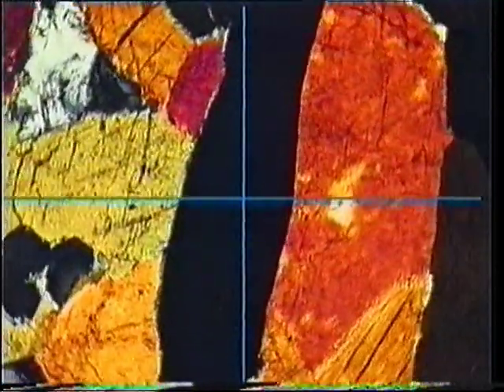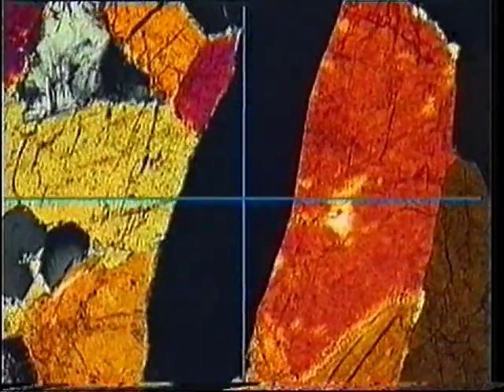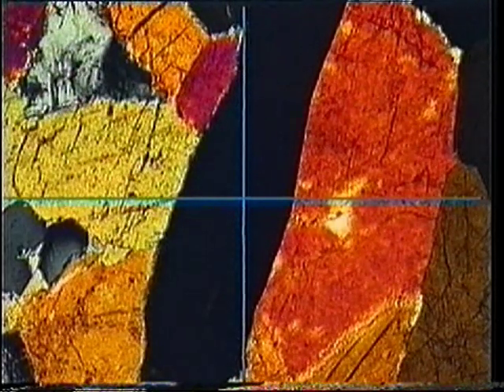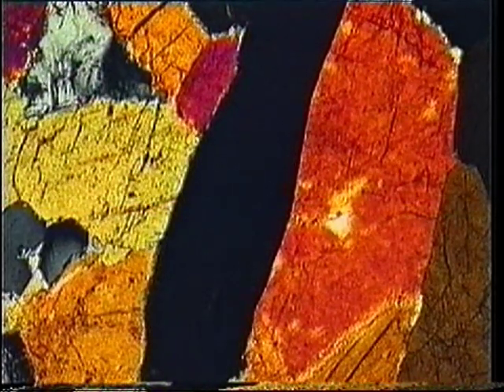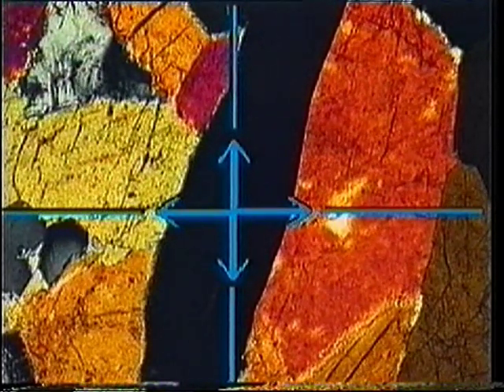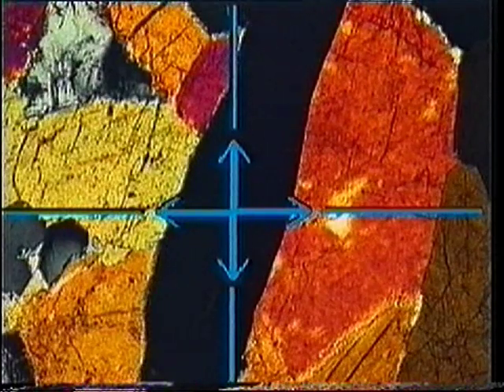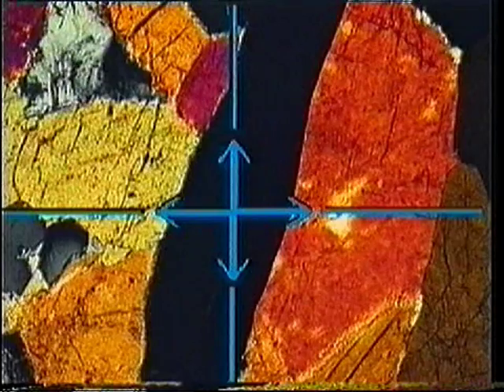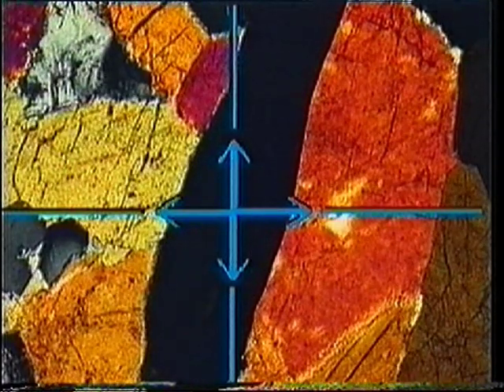Rotate to the extinction position and note the stage reading again. Subtract the readings. 20 degrees is the result. The vibration directions at extinction are north-south and east-west as shown. The measured angle is between the C-axis and the north-south vibration direction.